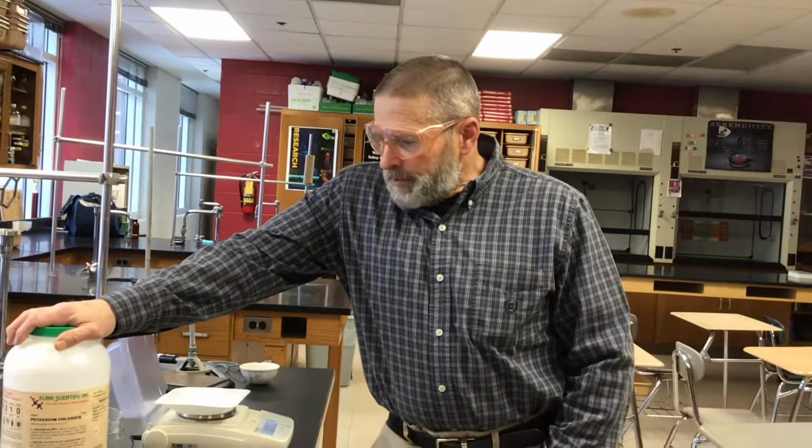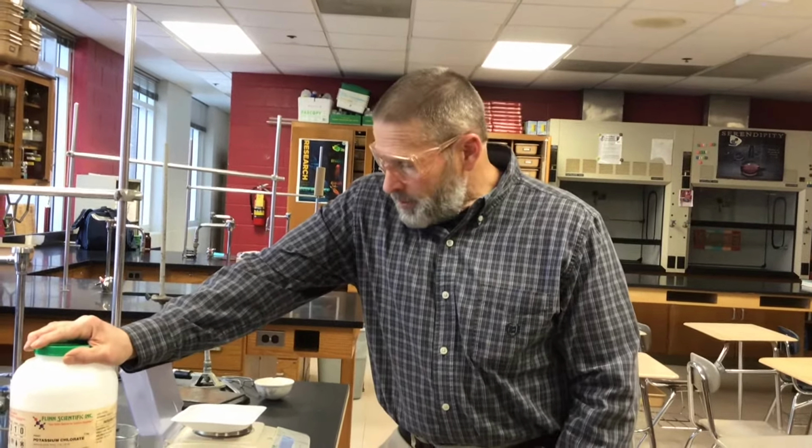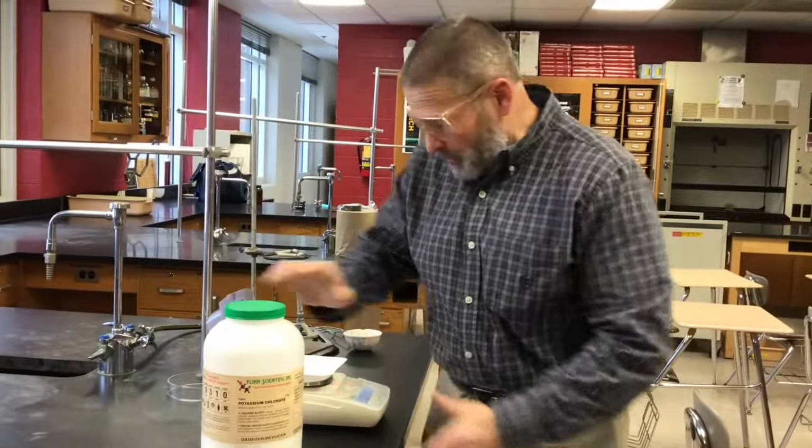So that's actually what happens when we heat this up. Potassium chlorate, KClO3, is going to decompose into 2 things: potassium chloride, KCl, and oxygen gas, O2. And so there'll be a mass change before and after heating. That difference is the oxygen that's been driven off. And we can use that information then to get percent of oxygen by mass in potassium chlorate. So one thing we're going to have to know is the mass of the compound that we're starting with.